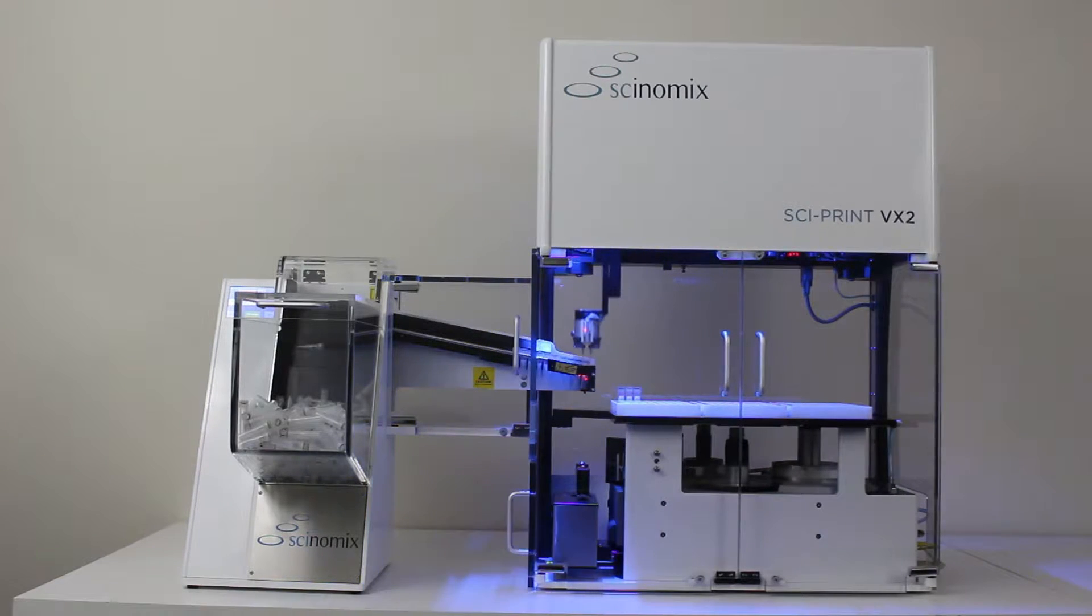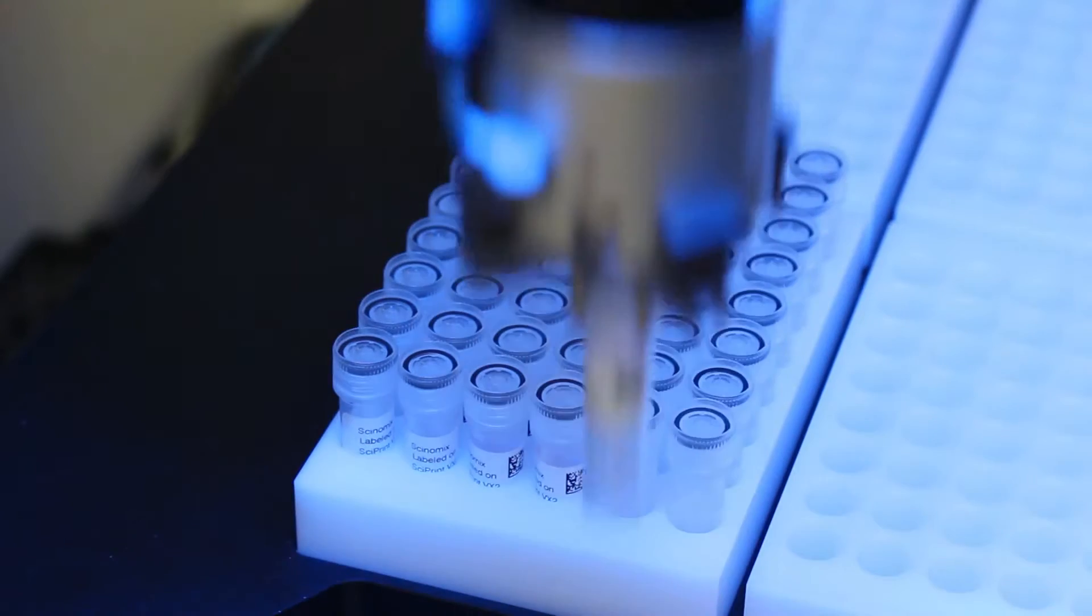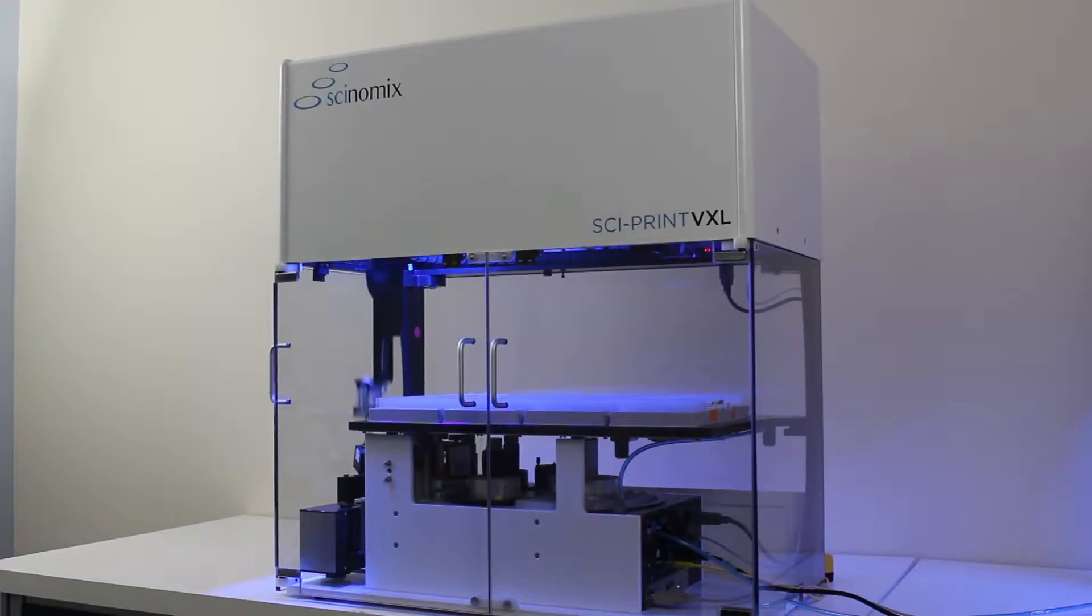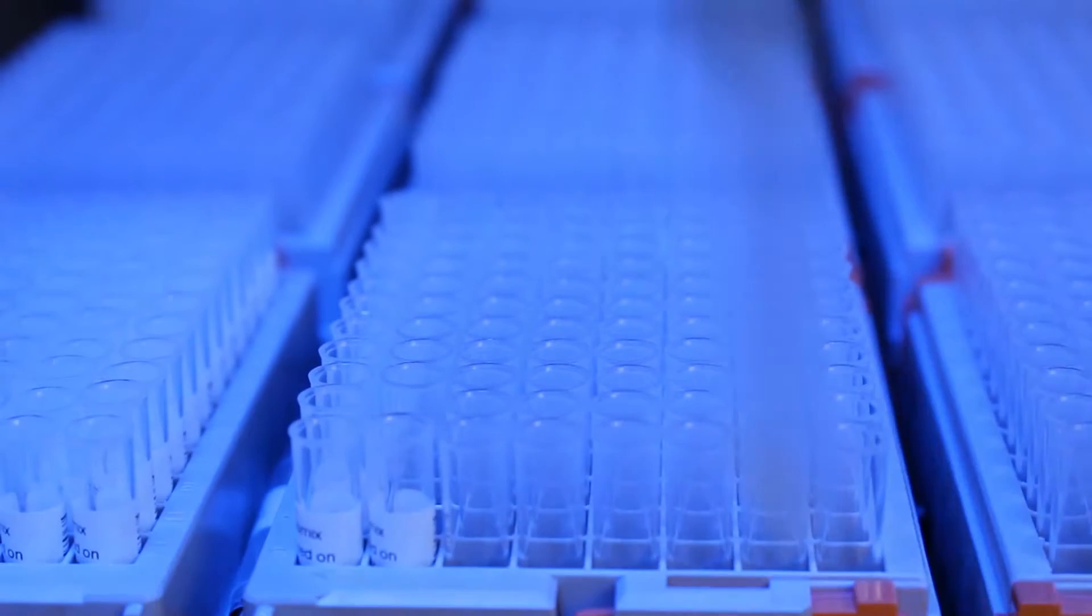The SciPrint VX2 fully automated vial labeler has a 6-position work deck that accommodates up to 600 tubes. The SciPrint VXL fully automated vial labeler has a 12-position work deck that accommodates up to 1200 tubes.